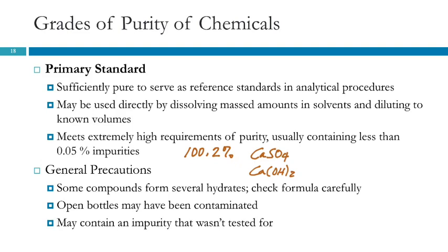You may have a primary standard, but if the bottle has been opened, it's possible that that bottle has been contaminated. Also, your reagents can contain impurities that were not tested for. And so that's something to watch out for.